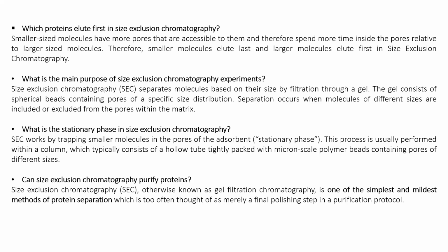Some of them will be retained and some of them will be removed. Some of them will be included and some of them will be excluded from the pores within the matrix. And that's why the name comes as size exclusion chromatography. So based on the size, some of them will be included inside the beads and some of them will be excluded outside.